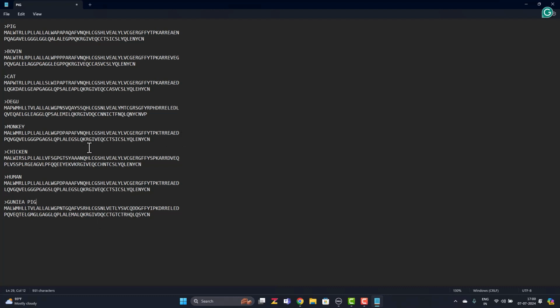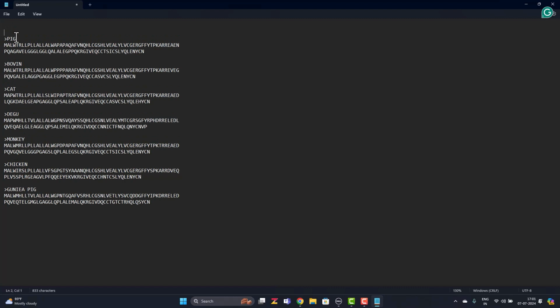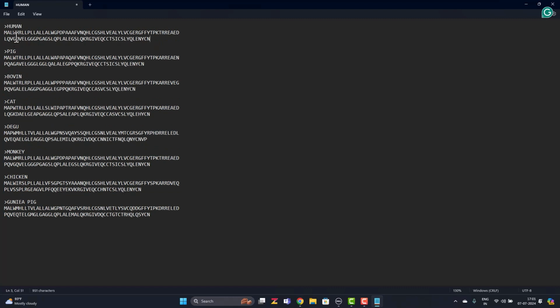So we are going to save this file with all the sequences. I keep the Homo sapiens first. It is not necessary, but that's the order in which we have downloaded the sequences. So I am keeping this in the first place. We'll save this file as FASTA file format.